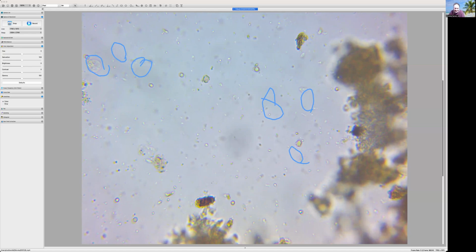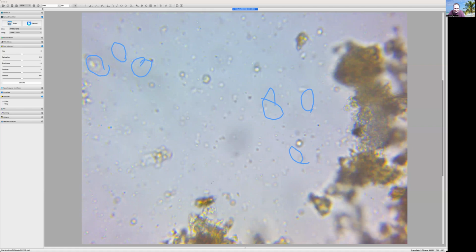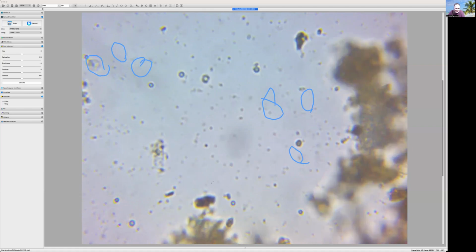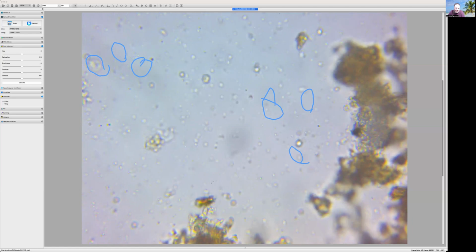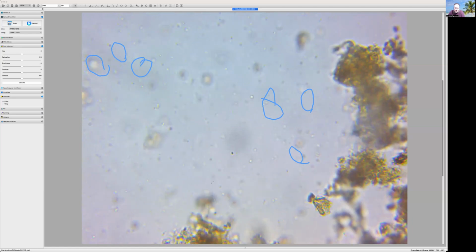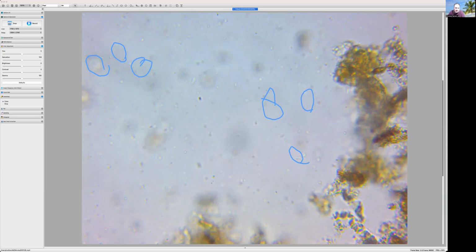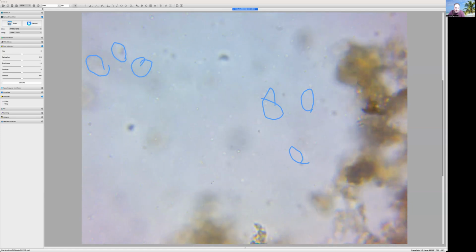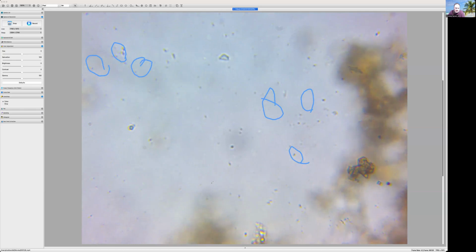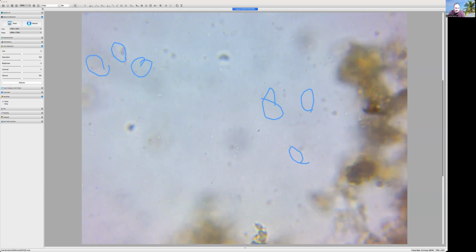Okay, somebody's going down low. Let's see if I can find him going across there. I missed him. It's just so darn hard to catch them if they're moving super fast. Let's go up to the top of this. Let's see what we can see bacteria-wise. See any real long rod shapes.